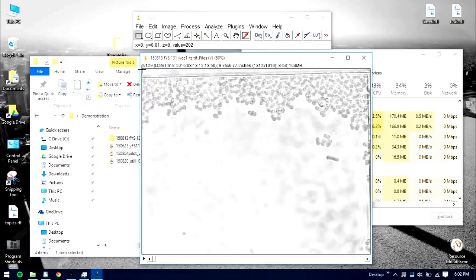And the value that it shows you is going to be the grayness value, if that makes sense. So 0 is black and 255 is white, and everything between tells you a different value that you might find. A tool that you can use to analyze that is this line profile tool.